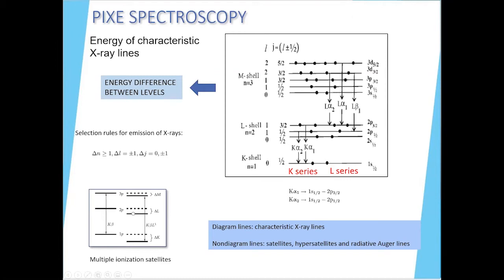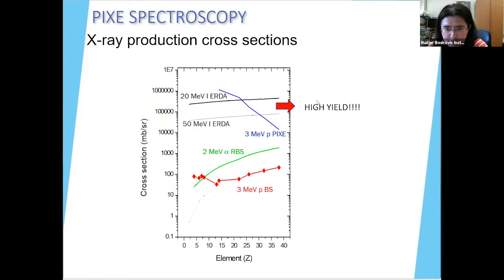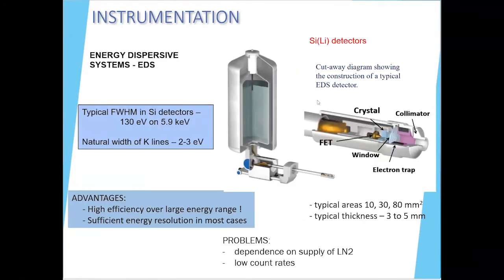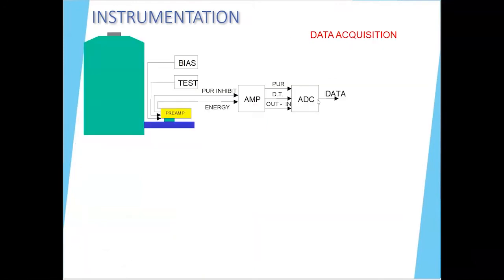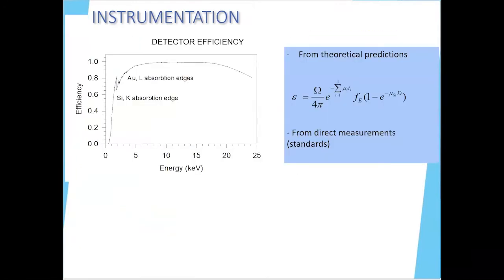In terms of this filter for low energy, when you showed this spectrum, we still see the low energy part. Why don't you cut it off completely?